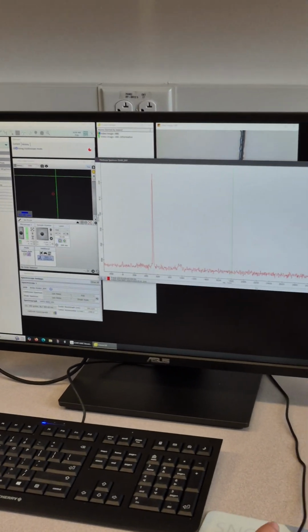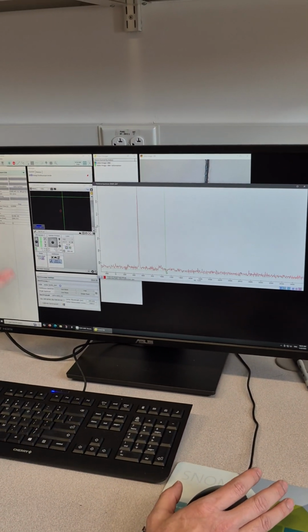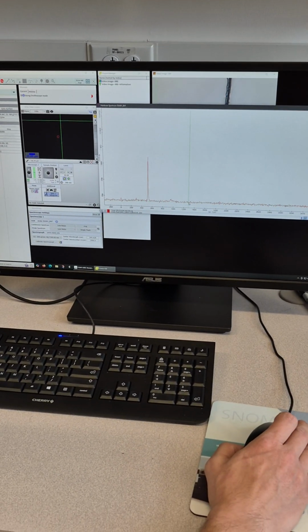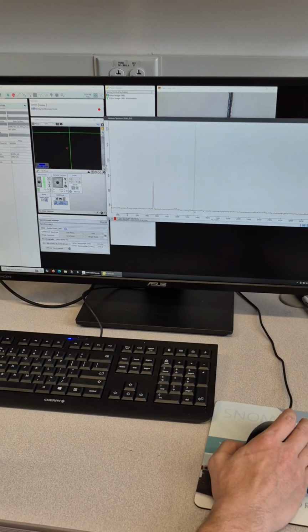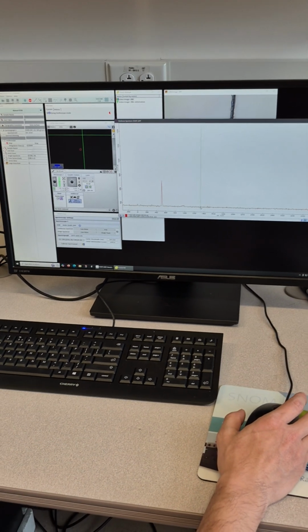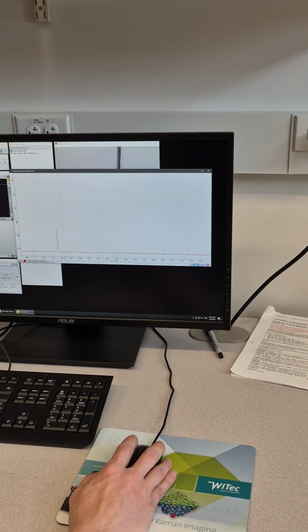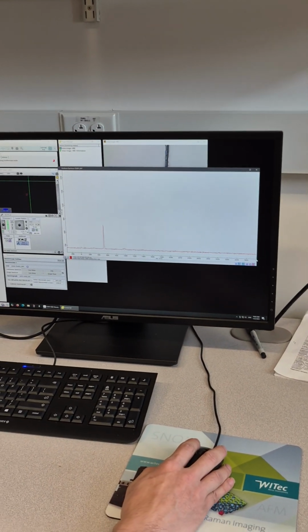Okay. And this is a live Raman. You can see it's alive. Why did you click just before? I'll explain this and I'll go back to show you. So now it's roughly from 0 to close to 4000 range.